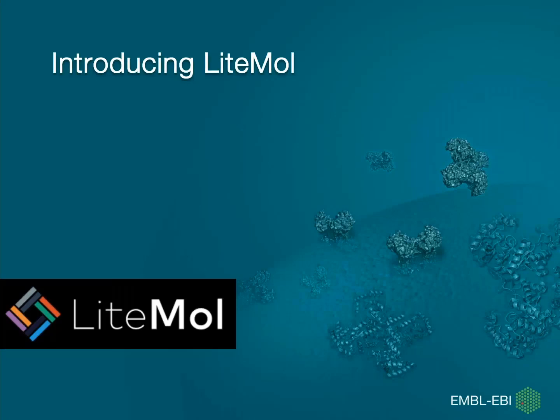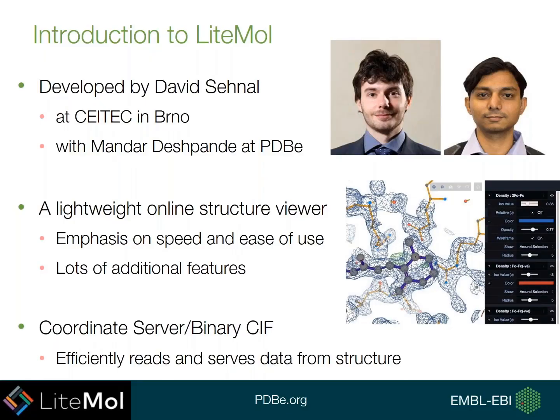LiteMol is a new viewer, and it's designed to visualize macromolecular structures quickly and easily online. It's been developed by David Sehnal at Masaryk University in Brno. He's the man on the left here. And he's been working alongside my colleague Mandar from the PDBe in order to create this viewer. And what it is, it's a browser-based online structure viewer. It's very lightweight, and the emphasis is really on the speed of use. However, because of the links to us at PDBe, there's also a lot of additional features that we've been able to incorporate into the viewer.